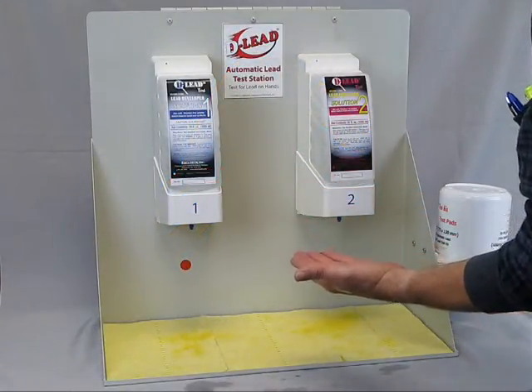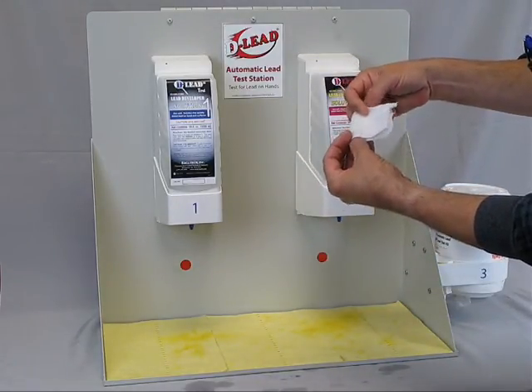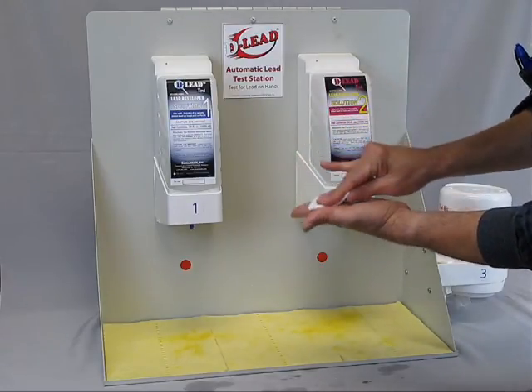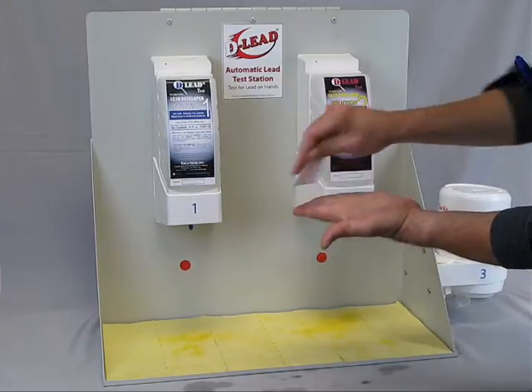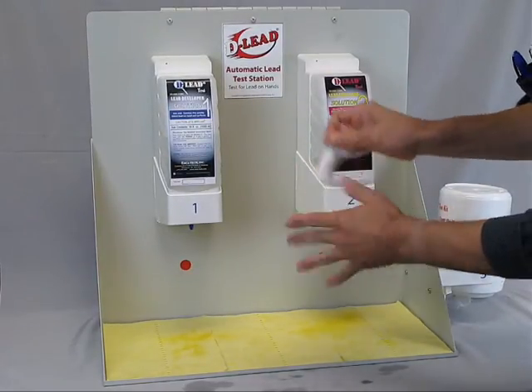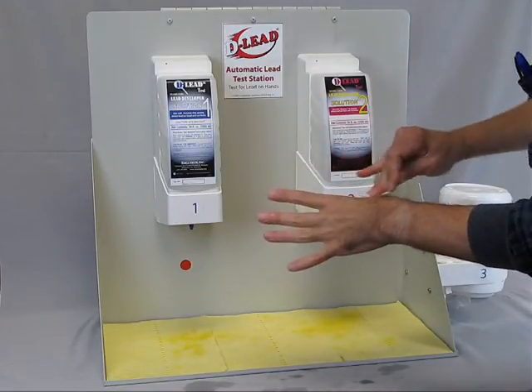If no yellow color can be seen on your hand, take a D-Lead Test Pad and fold it in half twice, making a one and a half by two inch pad. Wipe both sides of your hand thoroughly, getting in between the fingers. Make sure to soak up all the liquid on your hand. This will concentrate any yellow color not visibly seen directly on the skin.